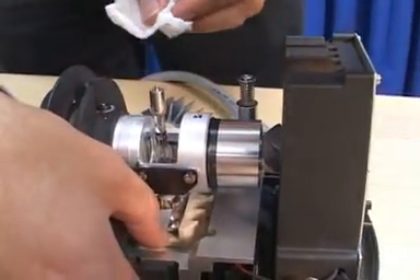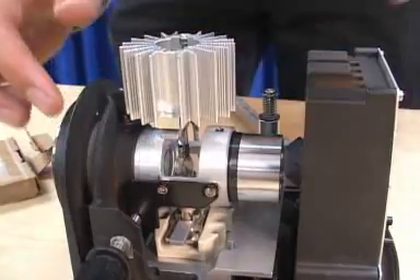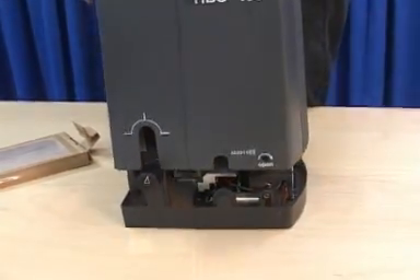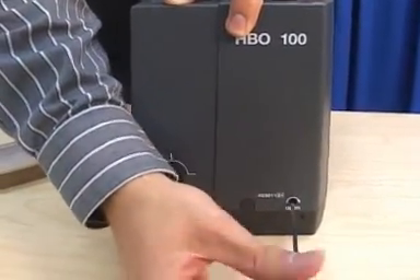Insert the HBO 100 burner into the lamp socket by pushing down the spring lever on the lamp socket. Make sure that the writing on the metal sleeve of the burner is upright where the heat sink connects. Squeeze the spring lever on the heat sink and attach it to the burner. Slide the cover back over the top and close the locking screws.